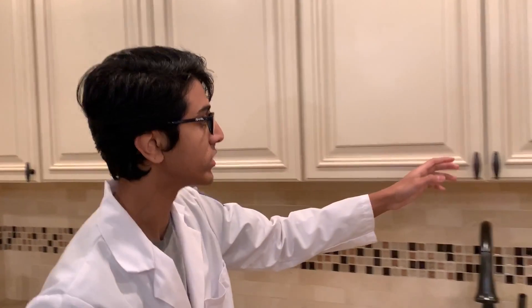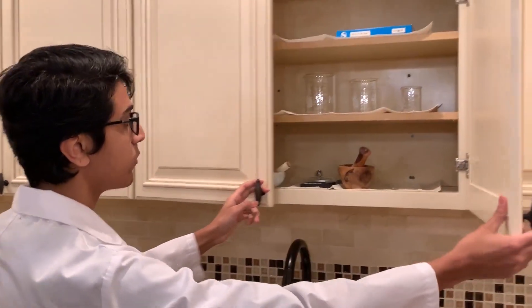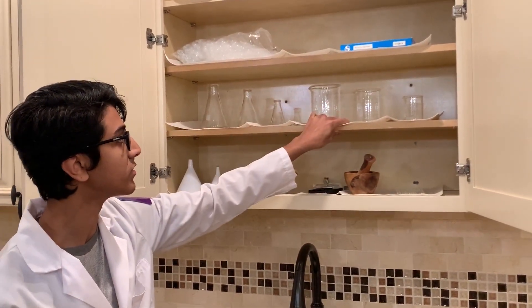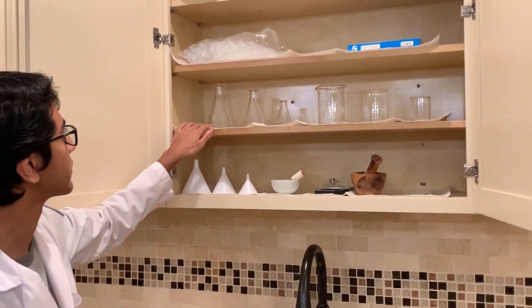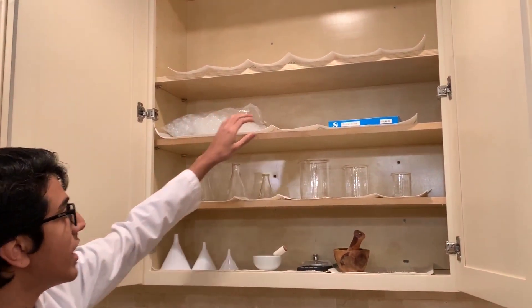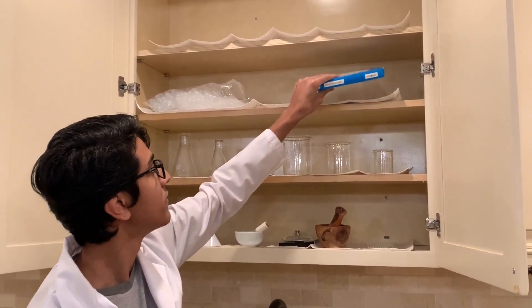Over here I keep most of my glassware equipment — three Erlenmeyer flasks, three beakers, that gets the job done. And I have pipettes at the top and some filter paper.